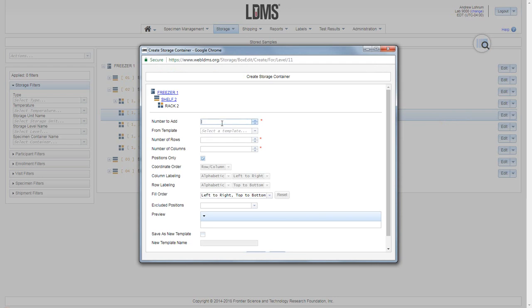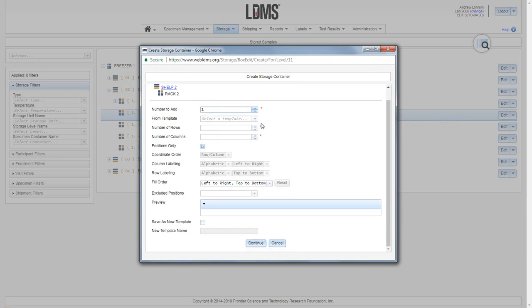The first question is how many boxes do you wish to add? For this example I will add a single container. Below that it asks you to select a template. You may or may not have these available at your laboratory.